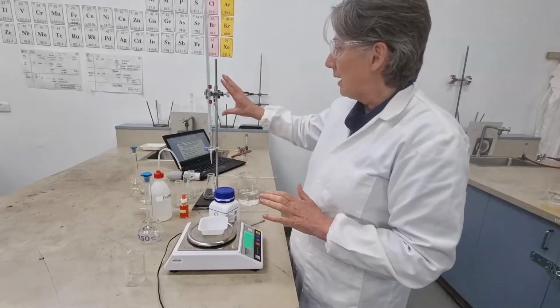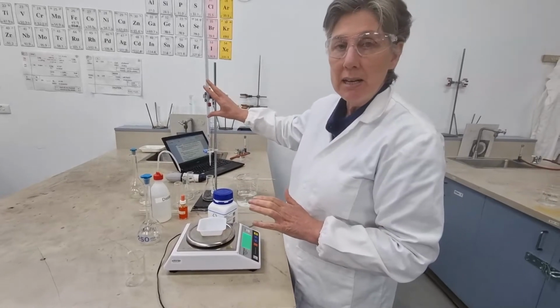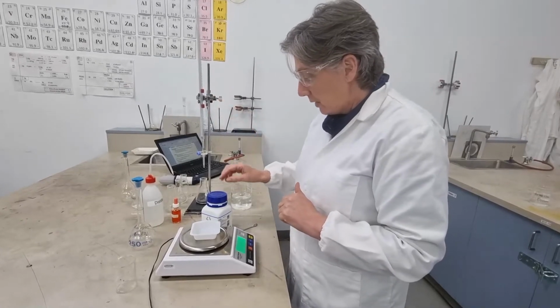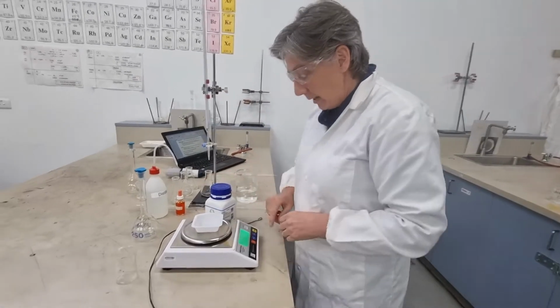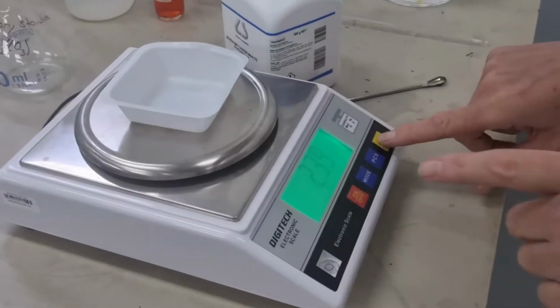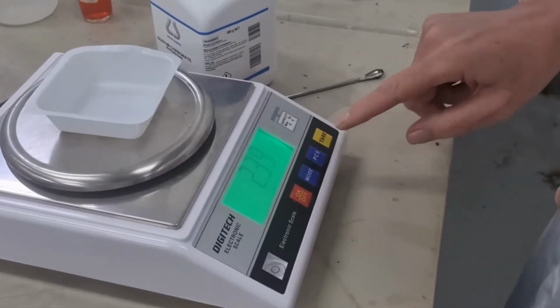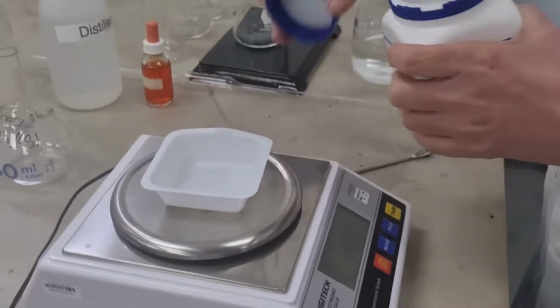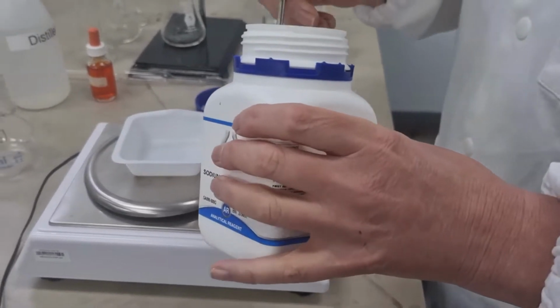Do, we need to make up our primary standard. So we need to make up the sodium carbonate so that we know the concentration of it. So we need to weigh it out. Remember, we had to zero this. So on the scales is the tare button. So we press that until it's zeroed, and then we're just measuring the weight of our sodium carbonate.